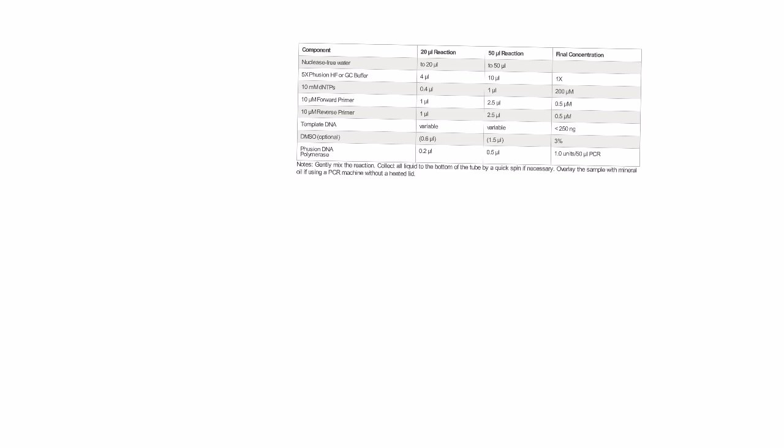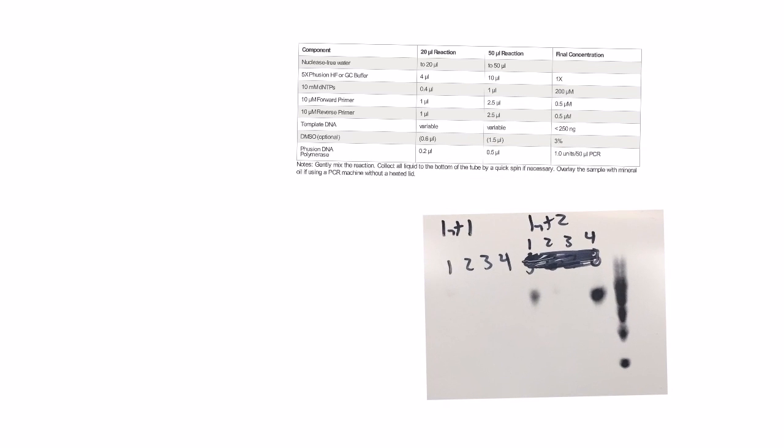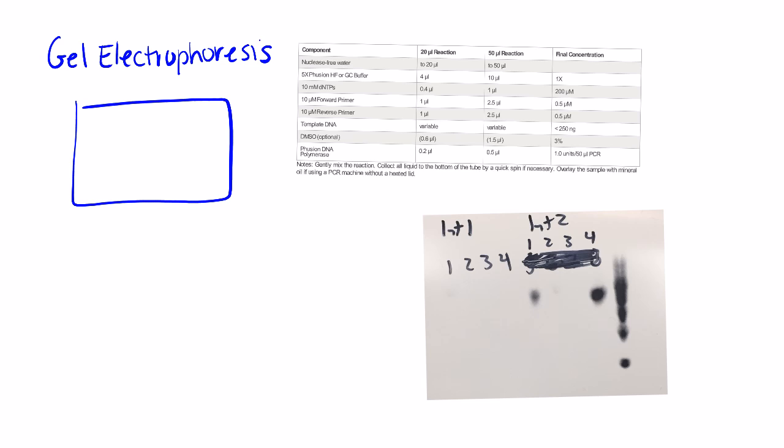Well, in short answer, no. Using gel electrophoresis, let's write that down, that's an important process. Gel electrophoresis. The PCR solutions were put into this kind of mechanism that had a negative end and a positive end. And our solutions were put in there. Negative end and a positive end.